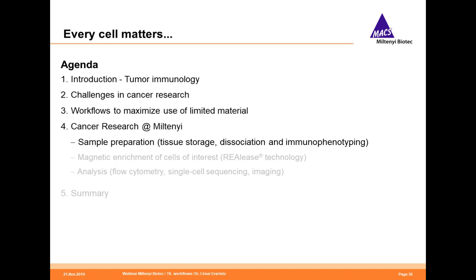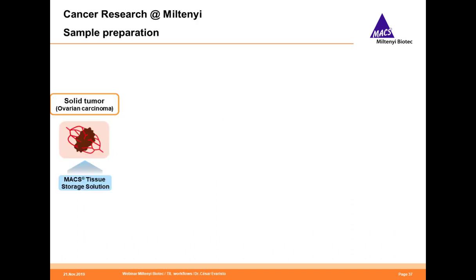I will do that by showcasing some of the analysis we performed on one particular sample from an ovarian cancer patient. Most of the data going forward was generated from a single tumor sample. Additional supporting data used to characterize the performance of particular tools will be clearly identified.